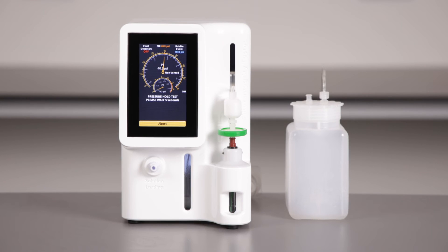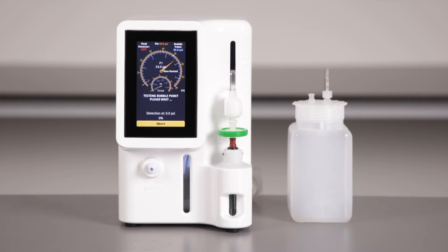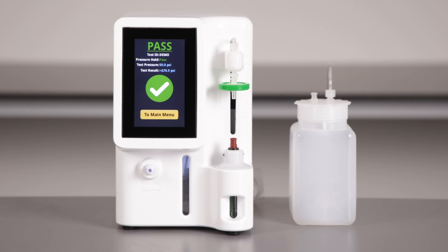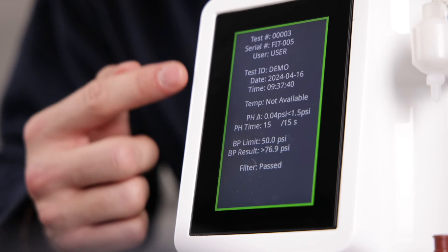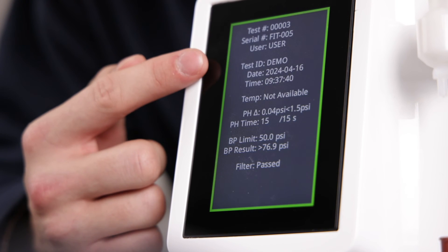Now, the unit runs the test while I am able to do other necessary things in the lab. After a minute or two, depending on my selected settings, I will see the unit has completed both the pressure hold and the bubble point test. I will then get a summary of the test result.